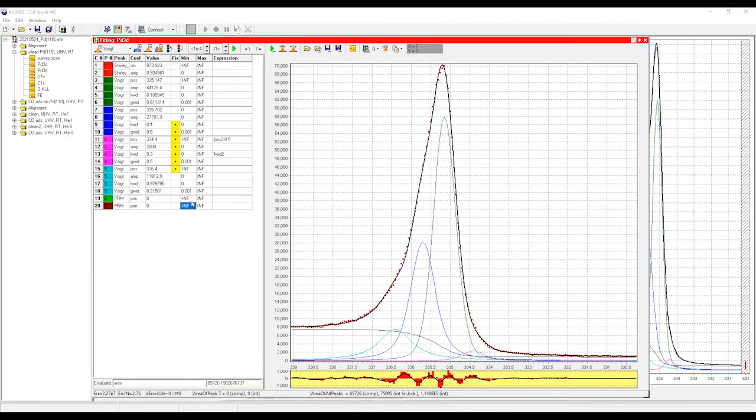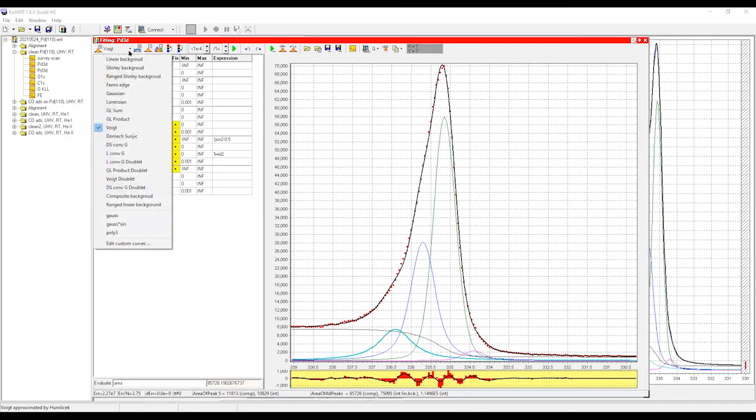I remember as a student, Tougaard actually came to a department, but here it is not used. We have special software from Tougaard, who was here a couple of years ago to give us a talk. However, I'm sure I have never personally used it. I have it somewhere on my computer. He showed us that using this background, it was possible to find the thickness and some structure of the layer and so on. That's right.